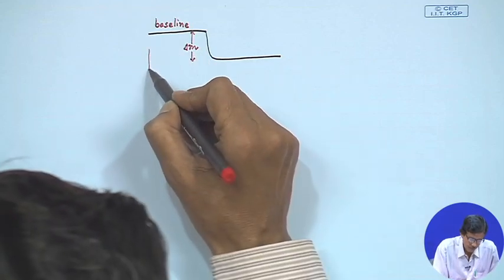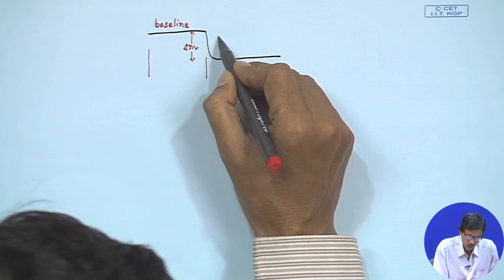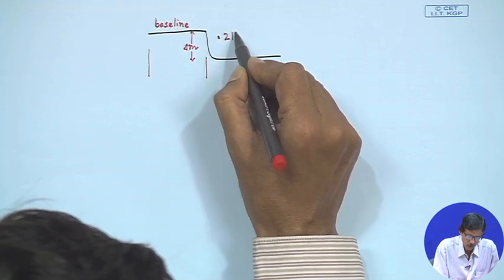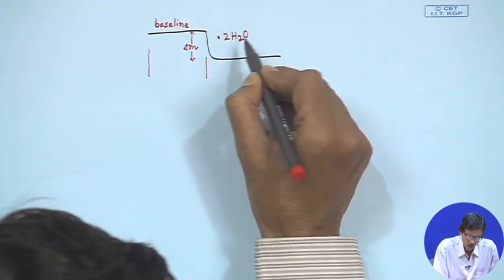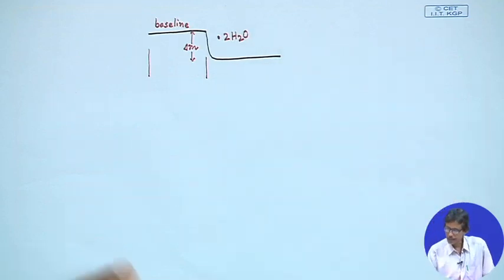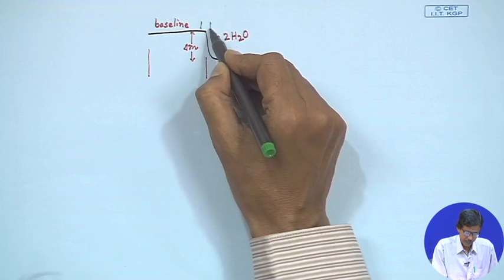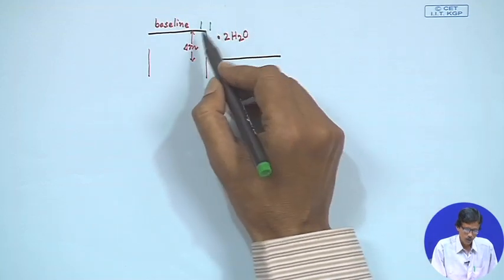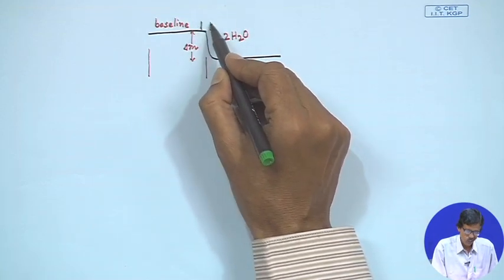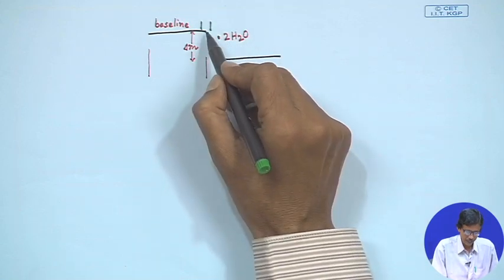That means, from a temperature range of say this to this, we see that the water of crystallization is going out in case of heating your oxalate samples of calcium and magnesium. This water loss from this particular point takes place within a very small temperature range. So, within a very small temperature range, the elimination of water from the crystal lattice is taking place.